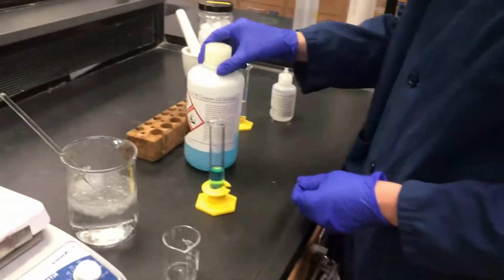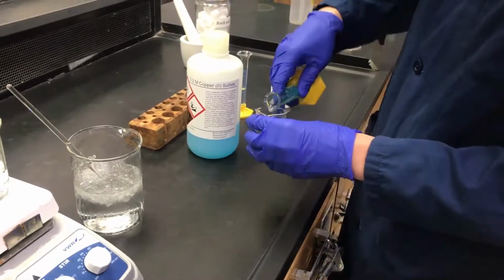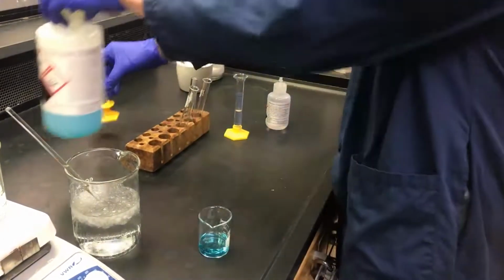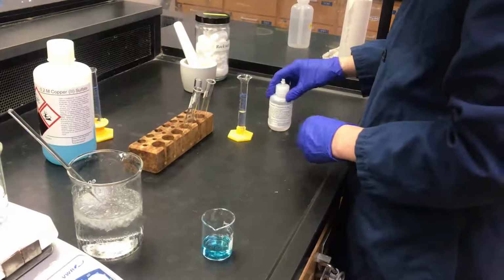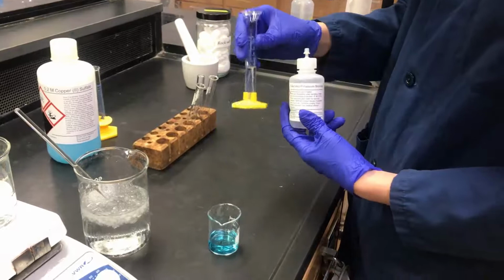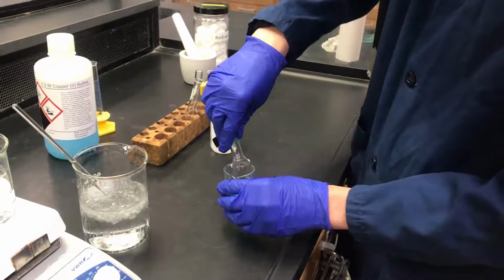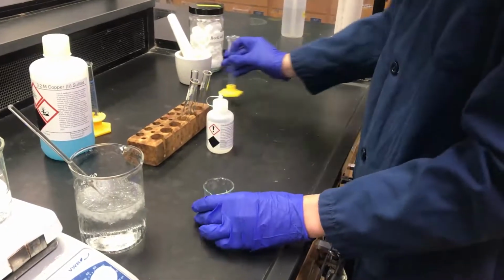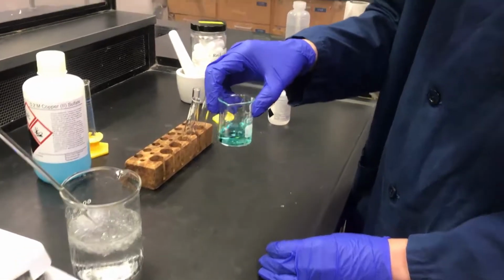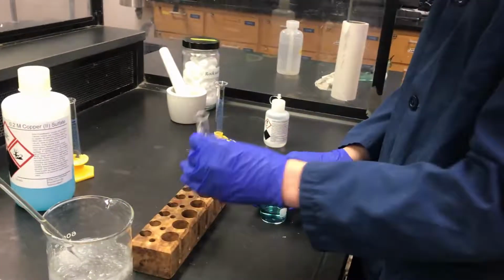So here in part 1, we have 0.20 molar copper sulfate, and we have 15 mL of this. We're going to add it to our 50 mL beaker. And then we have our potassium bromide, and we're going to add 5 mL of that into our 50 mL beaker. So already we see a little bit of a color change where the copper sulfate blue color combined with the potassium bromide now turns greener.